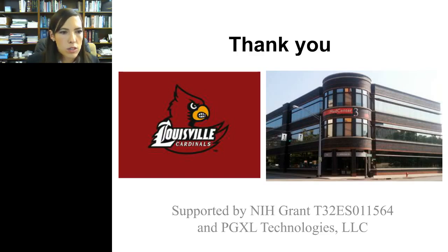Let's see some of these other questions. There's a question about how many dielectrophoretic cages are on the chip. So the chip houses 80,000 cages, so our sample must be enriched enough to have less than 80,000 cells.